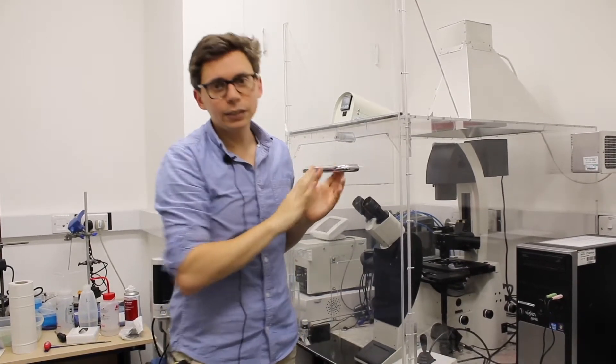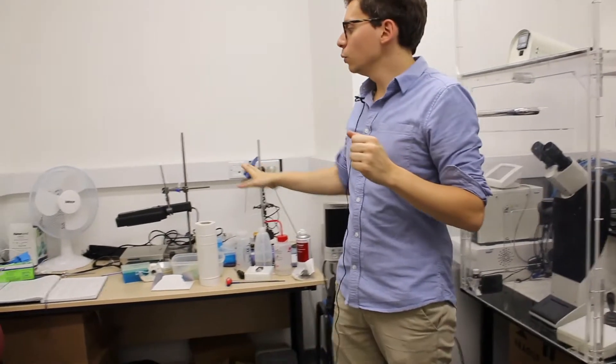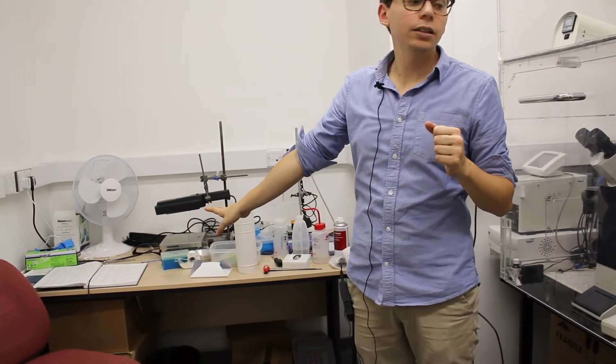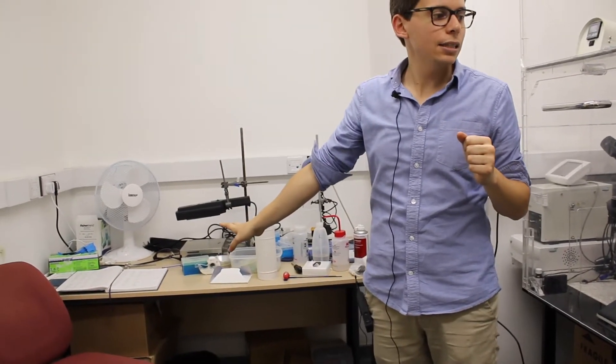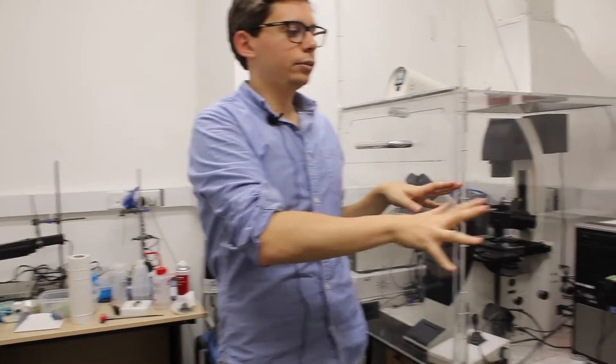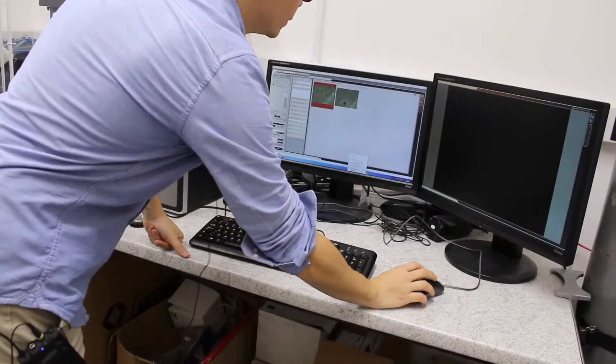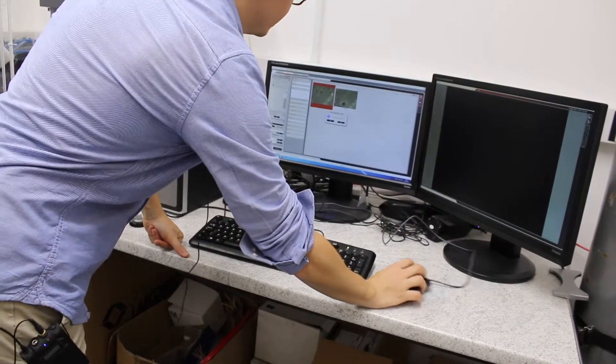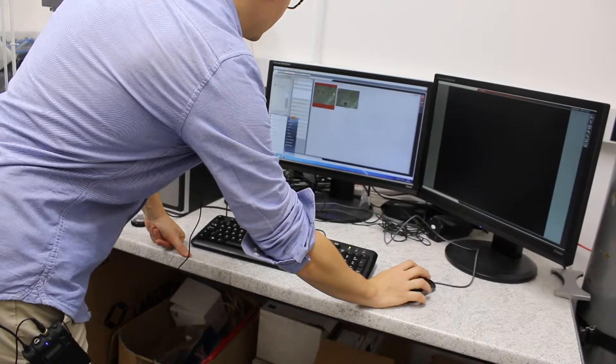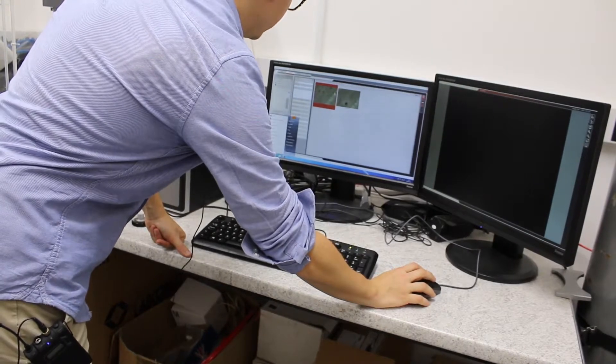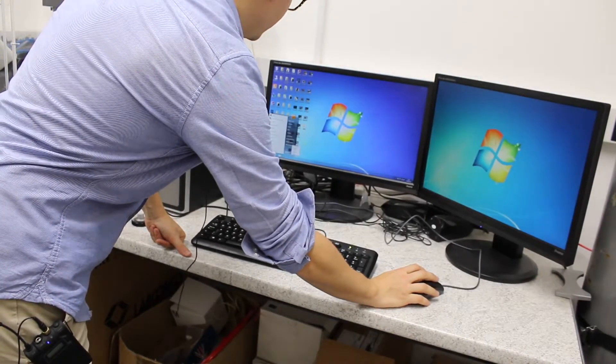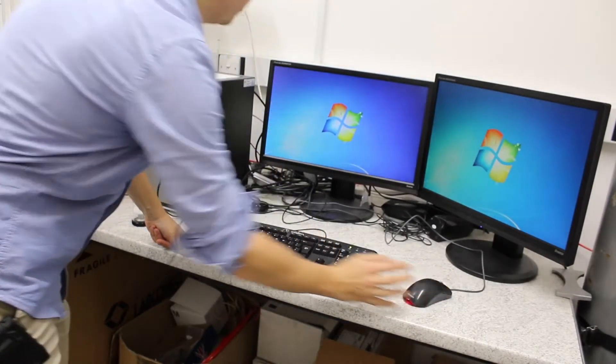You clean all the sample preparation area. And you log into the logbook. Don't forget that. And you clean also all the computer area. You can close the software and log off.